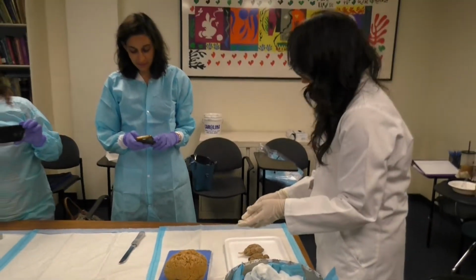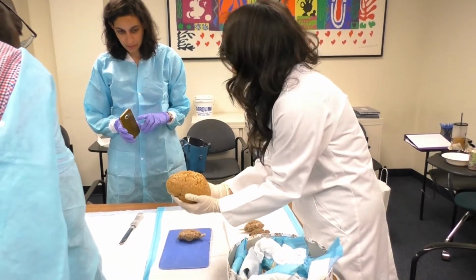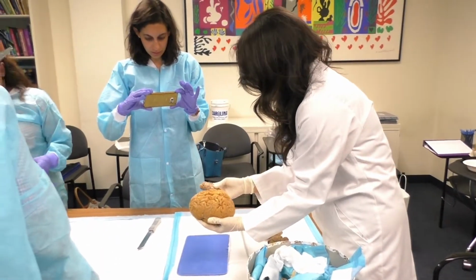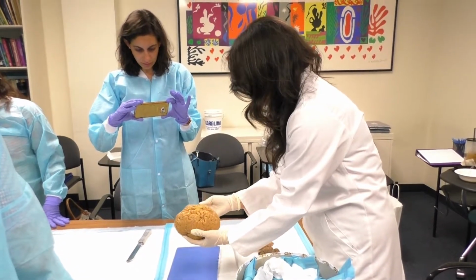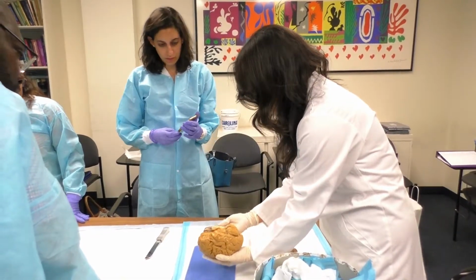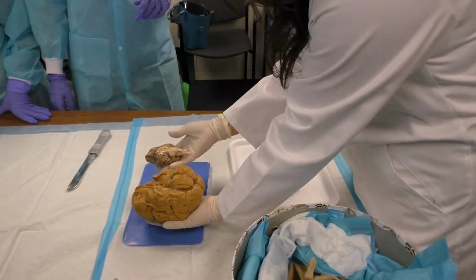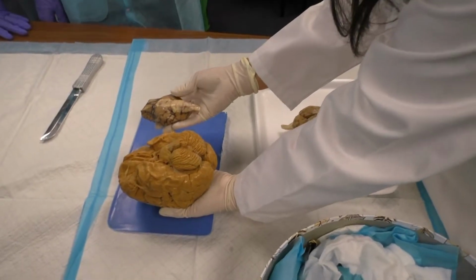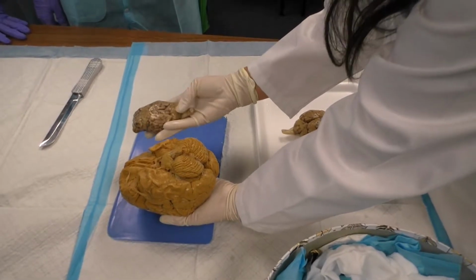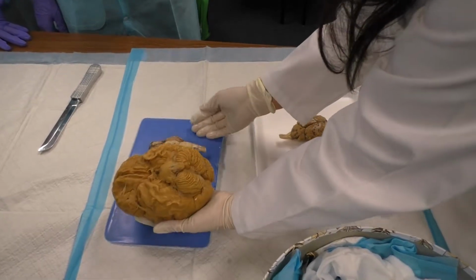Let's talk about size first. Okay, size. What else? They have very similar overall structure with the ridges and the stem. Yes, the gyri and sulci. Right, exactly. And notice anything similar or different if you go to the bottom? Oh, the cerebellum is relatively larger on the human brain. On the human brain, yeah, it's pretty big. It's pretty big relative in the sheep brain as well. Yeah. But anything else?